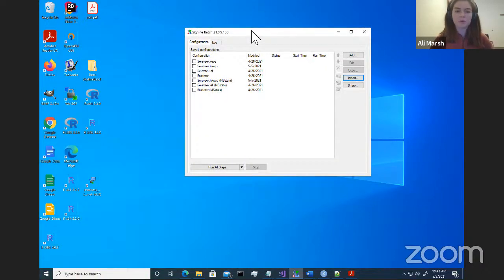All right, if everything went well, your configuration screen should look like this. There is a possibility, especially if you were using our version 4.0.5 yesterday, that some of these configurations are red. Configurations are red when they're invalid, so they couldn't find one of the files or R versions or Skyline versions that they are used to on your current computer.